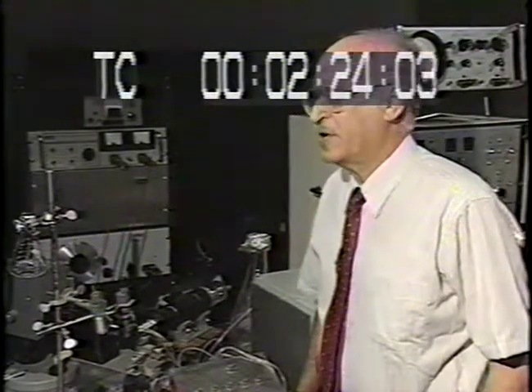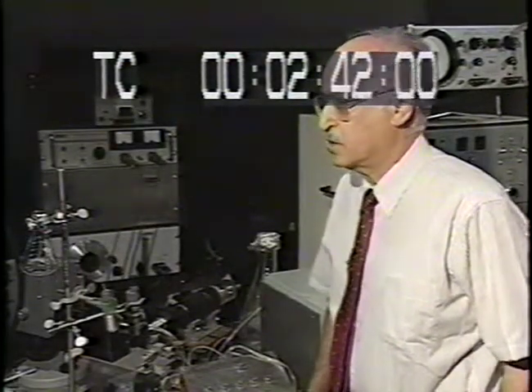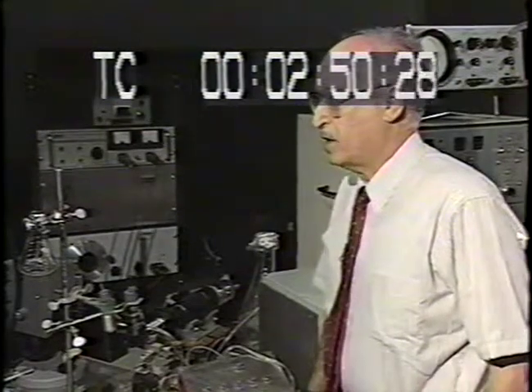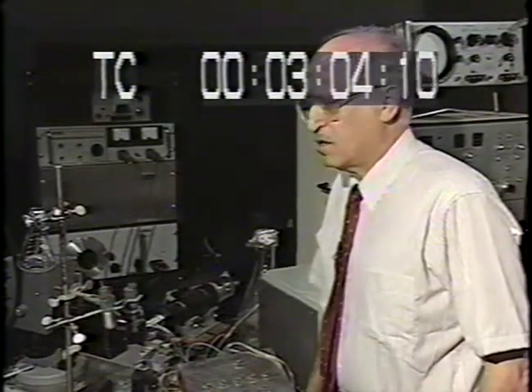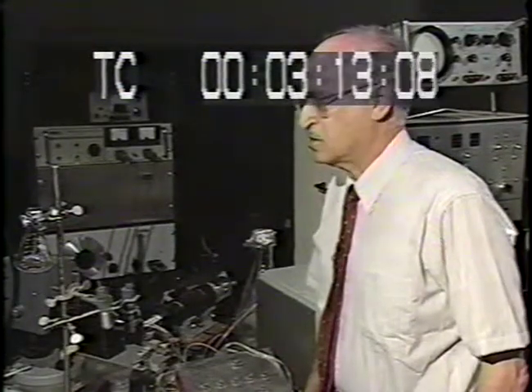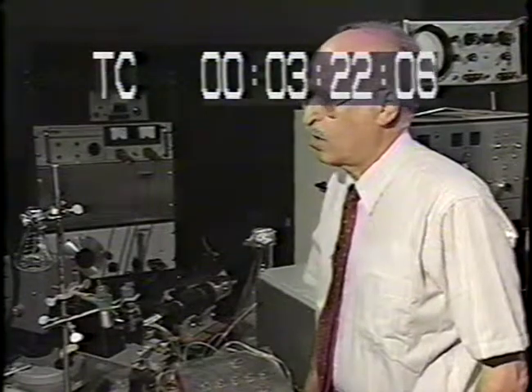I met Marvin Van Dilla through a letter he sent me in 1964 or 65. He was interested in our work with fluorescent cells because he wanted to use living organisms in the instrument he was building at Los Alamos. And so I visited him there, and I saw the instrument he had at the time, and obviously I realized the utility of such an instrument. But then it was not until I moved, at the time I was at the Stanford campus working for Syntex Institute of Molecular Biology. And when I moved here to Brown, we started a collaboration with Marvin.